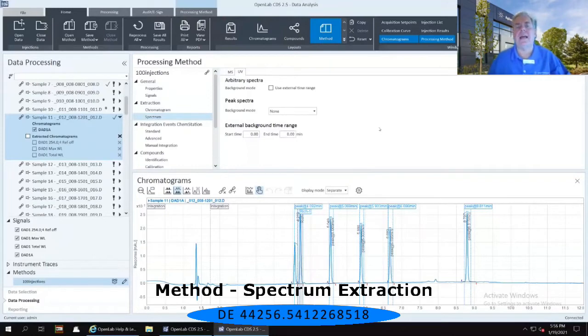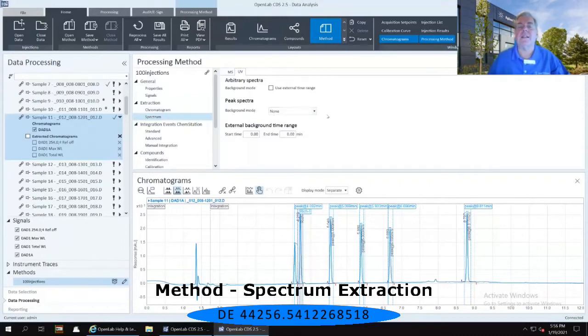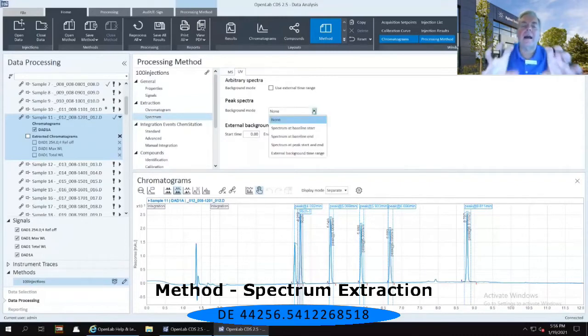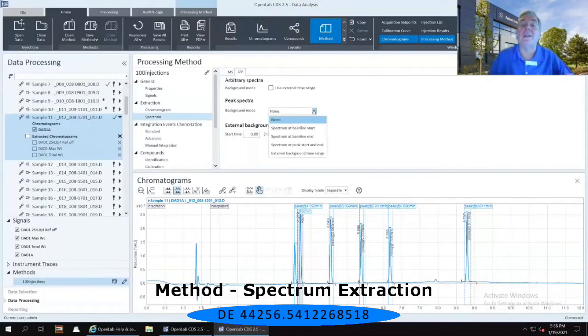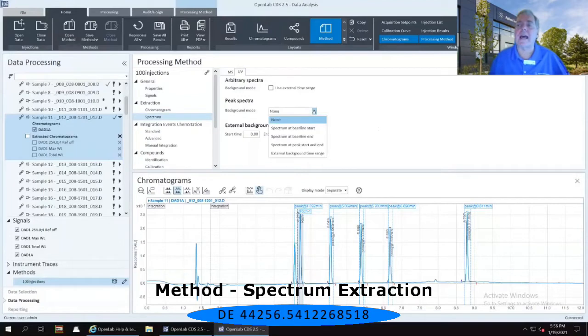If I select that pull-down menu where it says background mode, and it's currently set to none, if I select that downward-facing arrow, I've got a couple of different options of how I can do that spectral subtraction.